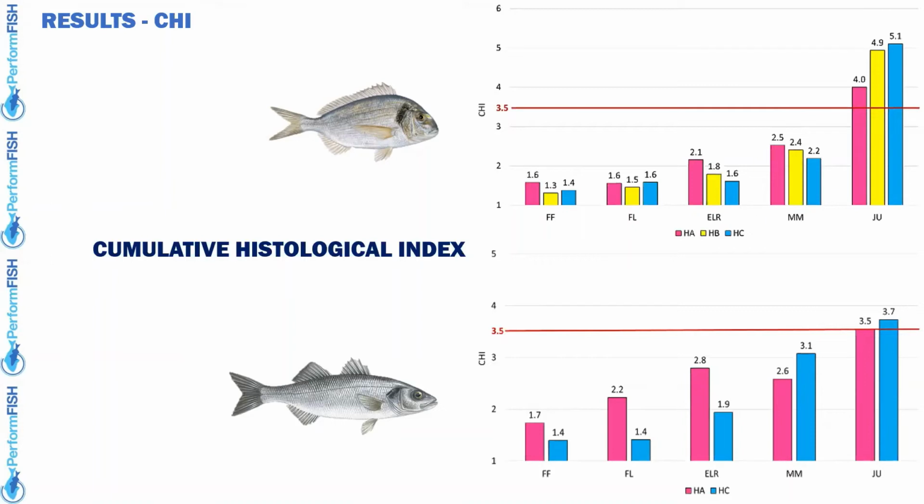and so evaluate specific pathological patterns. It would take too long to do this, but things change for the juveniles, especially for gilthead sea bream. We have some alterations, but now I show you some situations. Especially for gilthead sea bream, the exceeding of the warning threshold is for sure attributable to the biological specificity of this fish species when subjected to zootechnical forcing, and of course to the effect of the breeding system.